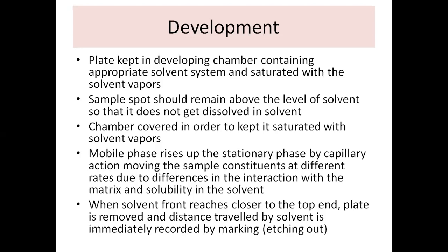And if the running of the solvent is not uniform, then there is a probability that the separation also will not be good, and the visibility of the sample spot will not be very good. The running of the spot will not be in one particular direction. Therefore, you have to close the lid of the chamber for some time, so that the entire chamber gets saturated with the vapors of the solvent. And only after that you can open up the lid, quickly keep your paper or your TLC plate in that chamber, and then close the lid once again.